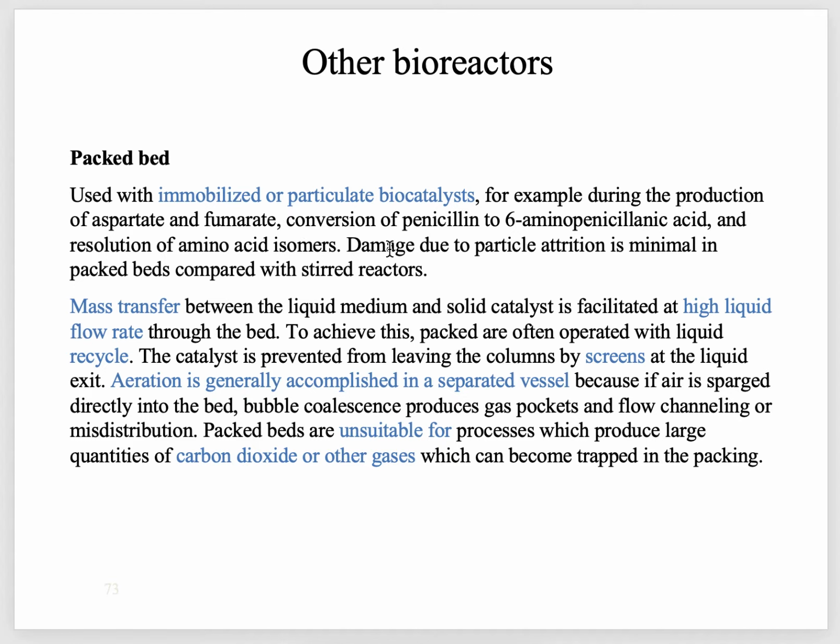In this kind of bioreactor, damage due to particle attrition is minimal compared with stirred bioreactors, because in stirred bioreactors mechanical stirrers are used which can damage the particles.